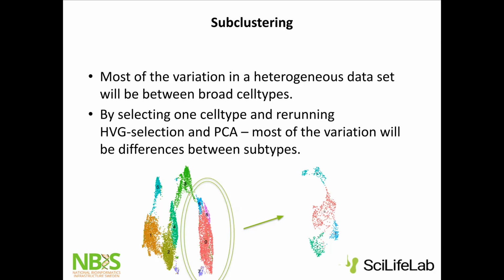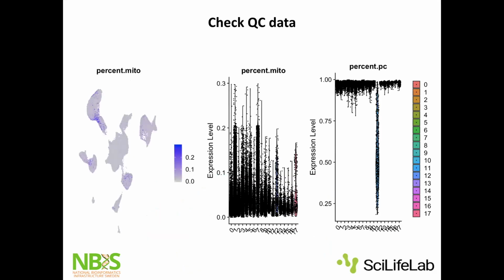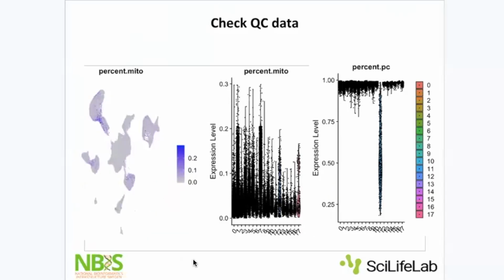Okay, thank you. I have a question. Yes, go ahead. Between the arguments like Leiden and Louvain, how do we make the choice? Because I know in Seurat the default had always been Louvain clusters, and then recently in the latest Seurat they implemented the option to put an argument equal to 4 to use Leiden clusters.